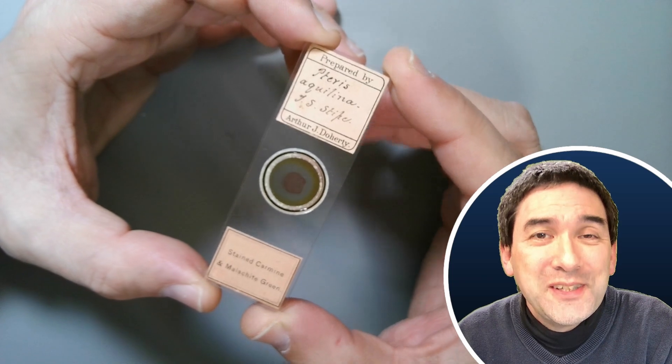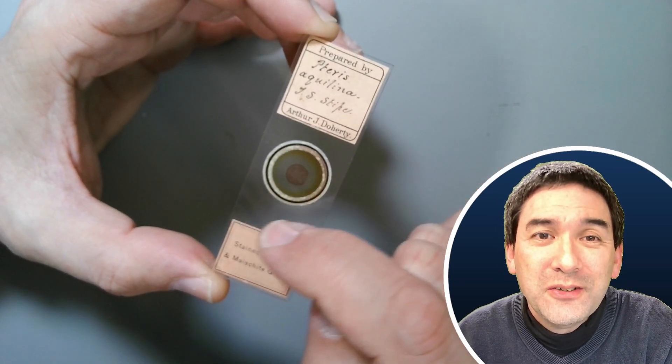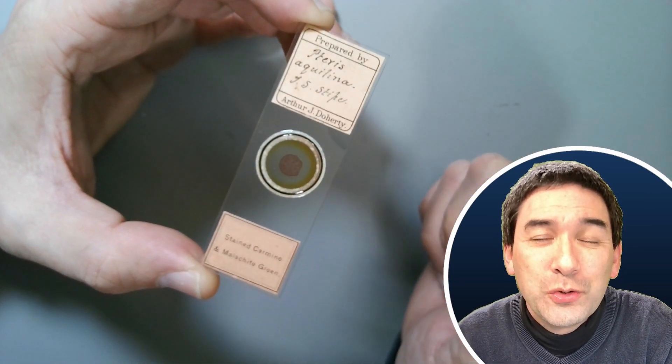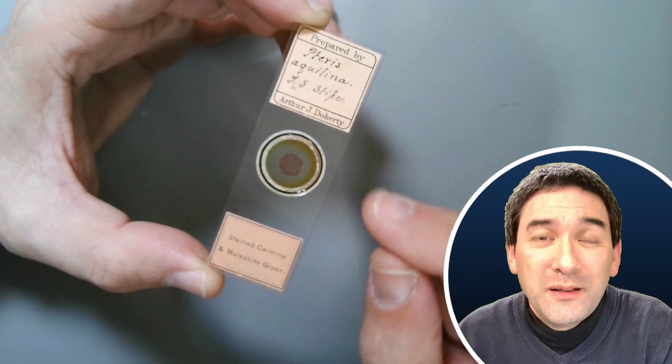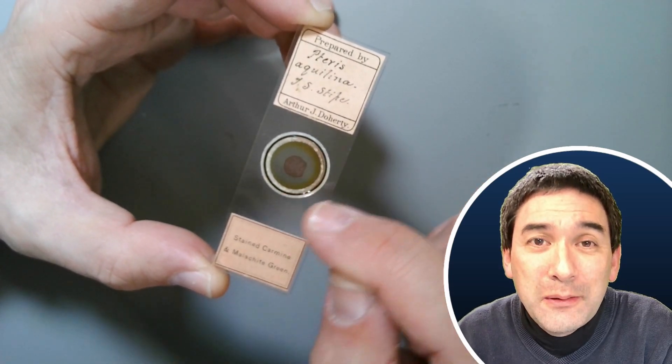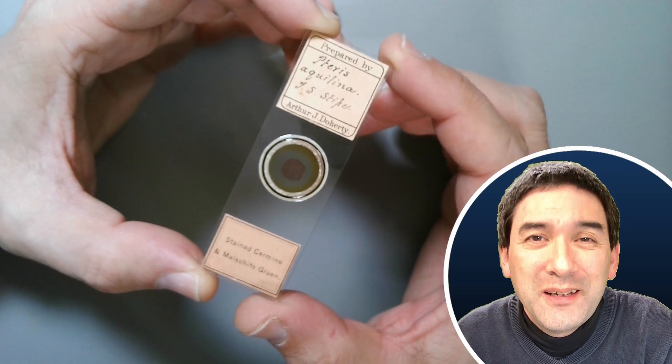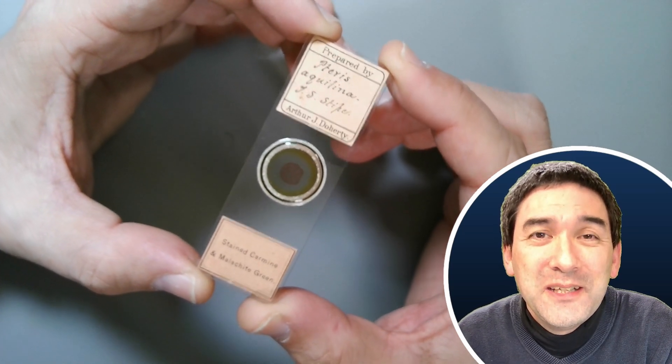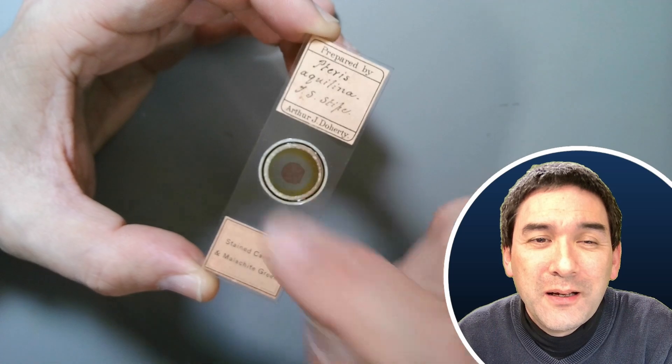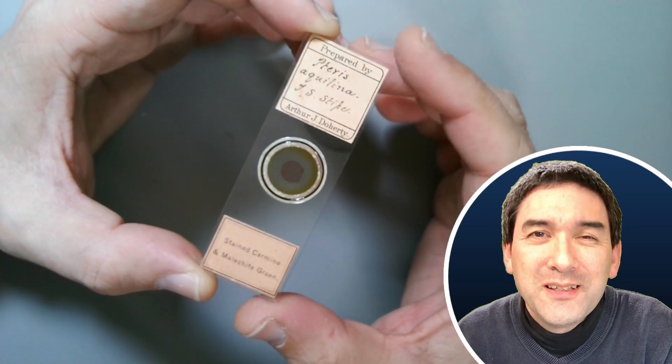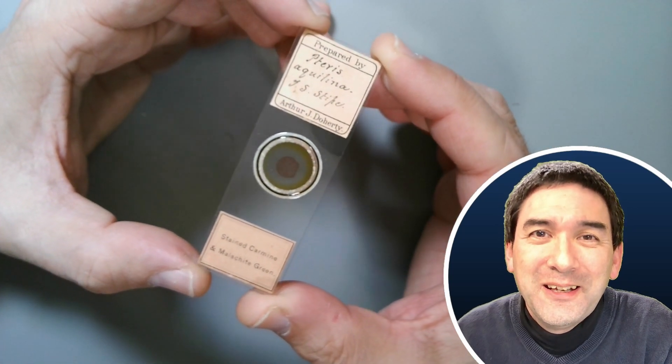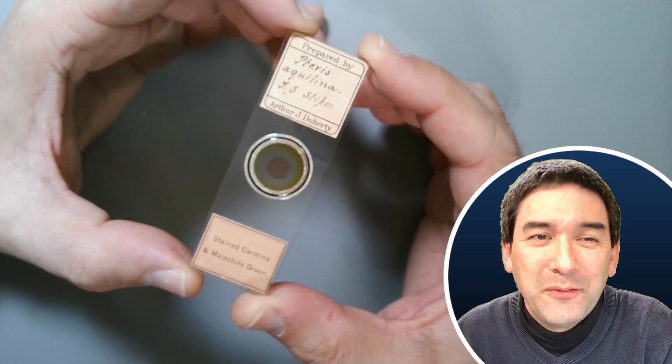And also another thing that you might notice is that the slide is ringed here. And the ring is here to protect the mounting medium and to stabilize the cover glass. But also, I've seen that several of his slides actually have this nice white black ringed pattern. So I think it's also maybe a little bit of a brand sign of his slides.